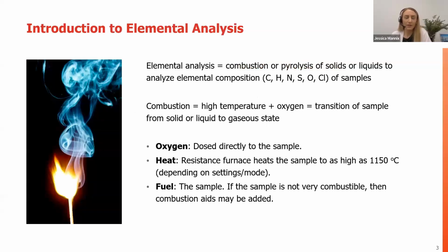All right, so what is elemental analysis? We're looking at the combustion or pyrolysis, typically of solids, but it could also be liquids, to analyze the elemental composition. Combustion itself is the high temperature environment with the presence of oxygen. And what we're doing is we're transitioning the sample from a liquid or solid state into the gaseous state, which makes it easier to manipulate.